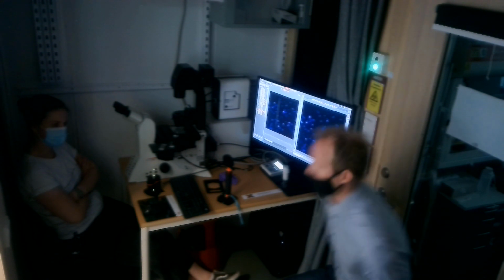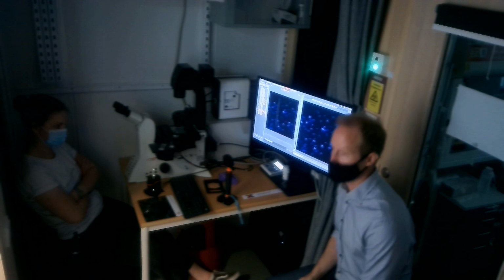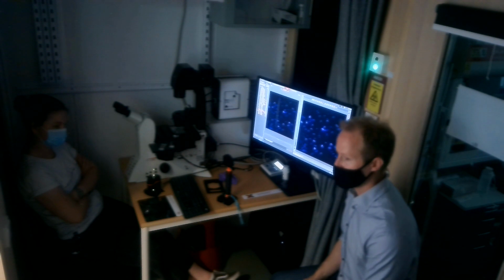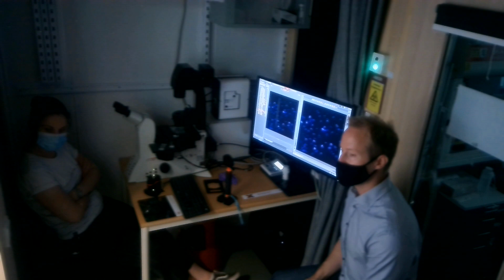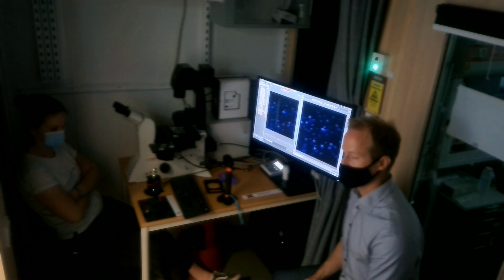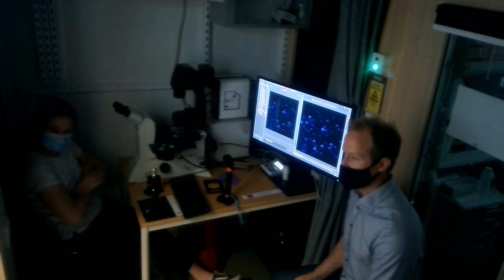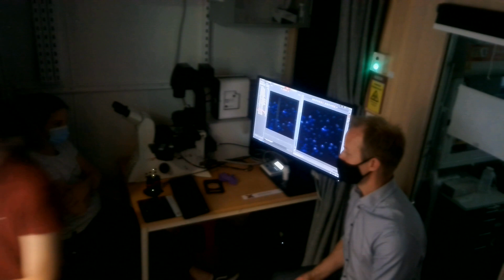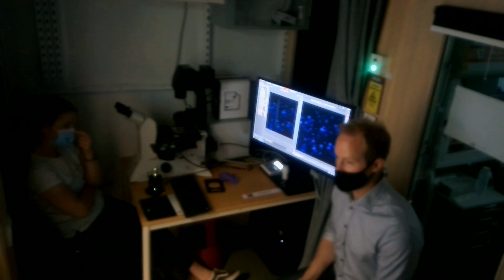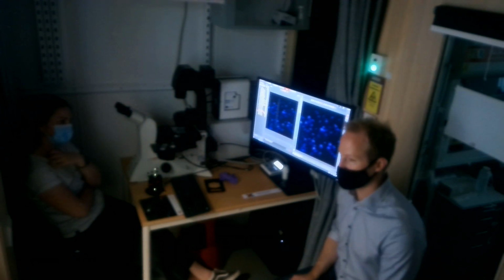So that one I think would be... That's what I mentioned, this is the COSMA. Okay. The computational optical sectioning microscopy or what. Okay. And the point is that when it recognizes that's the sharpest point, and on another sheet it's paler, it knows that that came from the out of focus point. So you have some calculations that you can do. That's not exactly that. So it makes it more contrasted, and it avoids seeing this film.